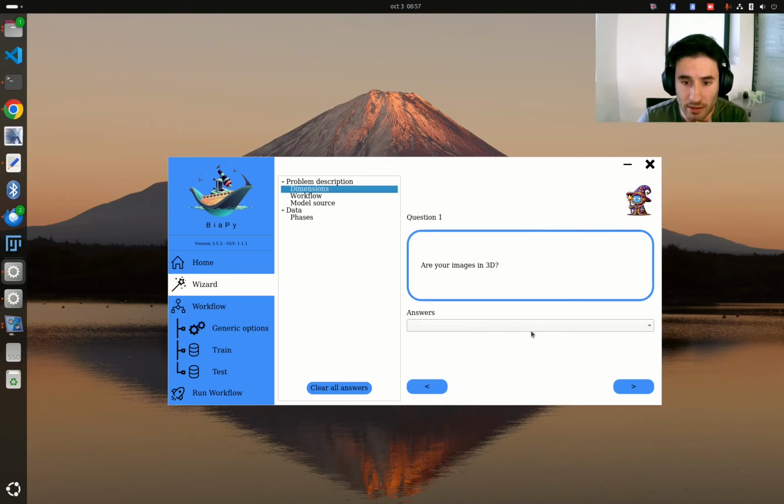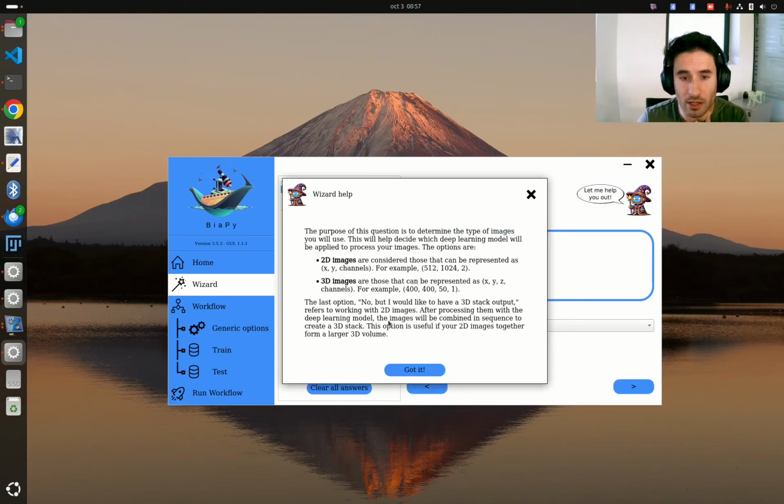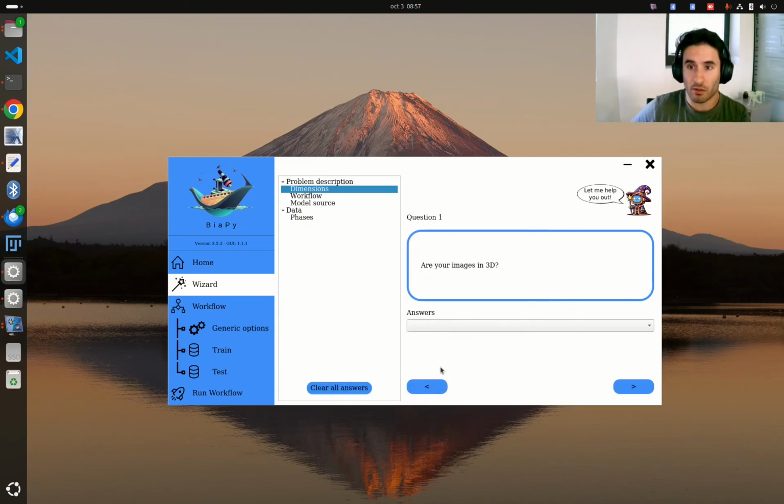Okay, the possible answers of that specific question, and as I said, you have here also the wizard that can help you out finding more information about the specific question that you are answering. So if you click on it, you will have a more detailed description. But in case you have any questions or any problems, or something is not very well described, please reach out to us or comment in the forum or on the GitHub page, so we can change it.